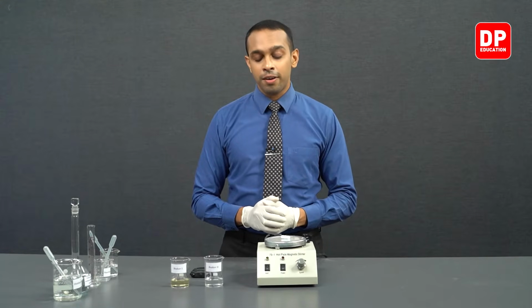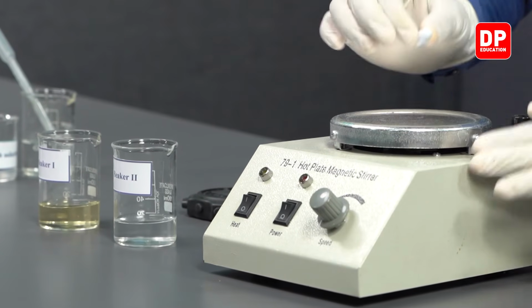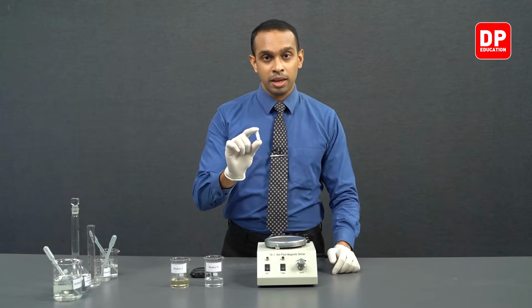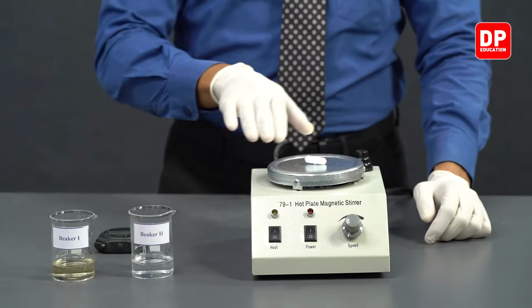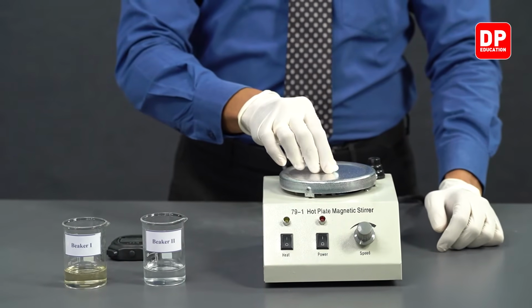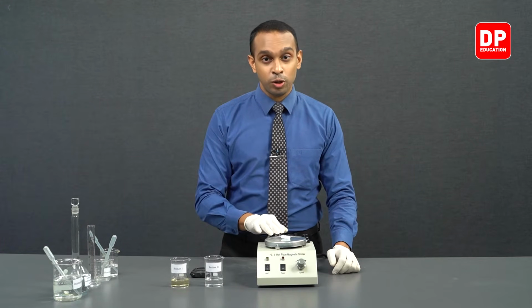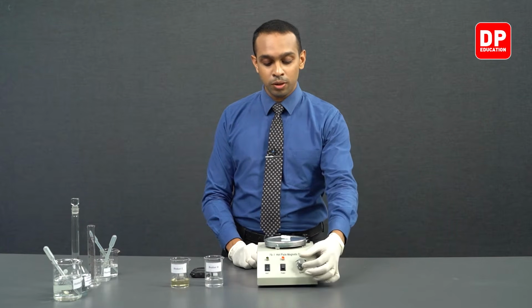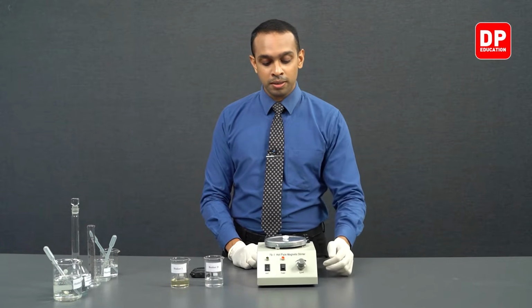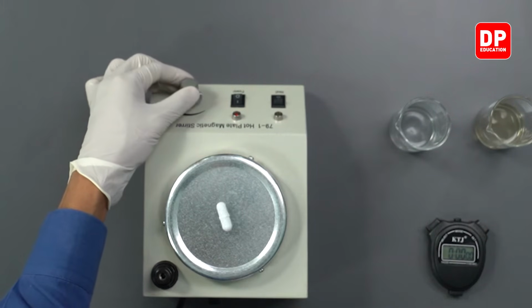Now students, we have our magnetic stirrer in front of us here. So magnetic stirrers come with a small magnet like this, a small magnetic rod, and beneath this pan there's another magnet which will help in spinning this magnet that we have on top of this surface. For example, if you turn this magnetic stirrer on and give it a little bit of power, you can see the magnet on top of this pan is starting to rotate.